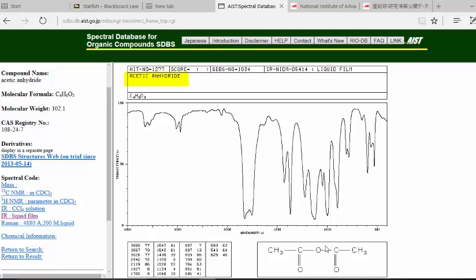So that's how that works. And you can type the other names in that you need to look for as well.